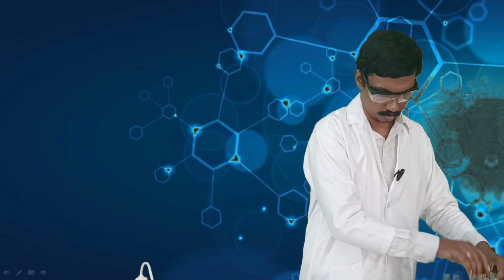You can see that the pinkish color has turned to brownish, which means that it decolorizes and your given compound is an unsaturated compound.